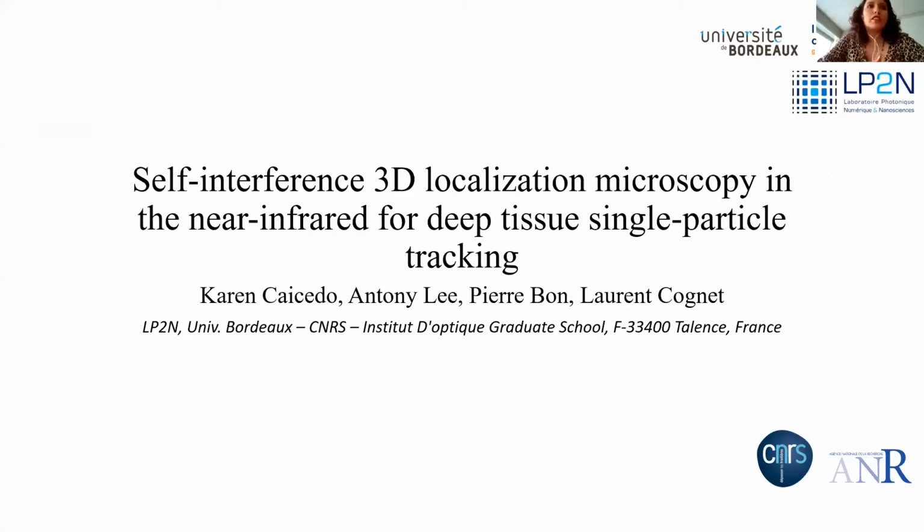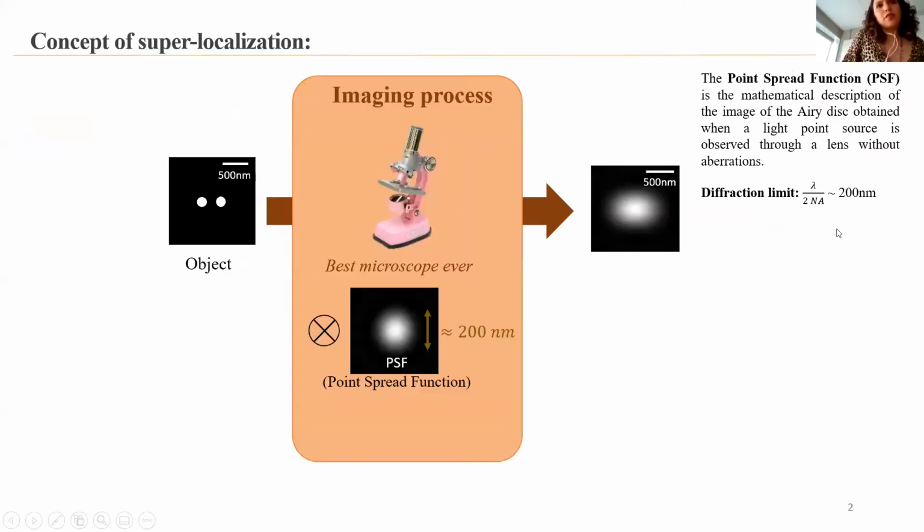And today I will talk about my project, which is self-interference 3D localization microscopy in the near infrared for deep tissue single particle tracking. So let's get started.